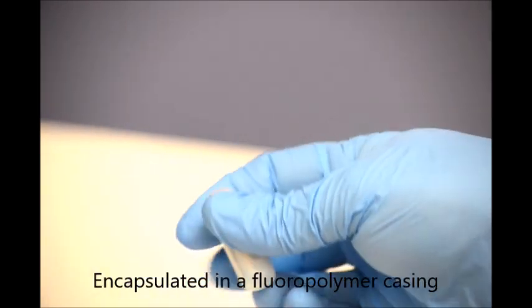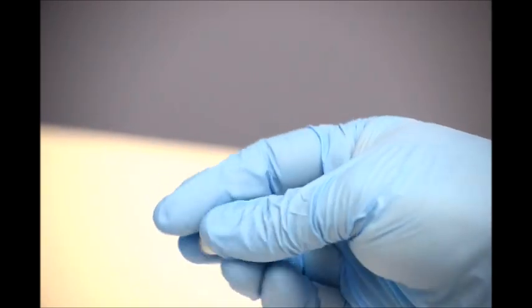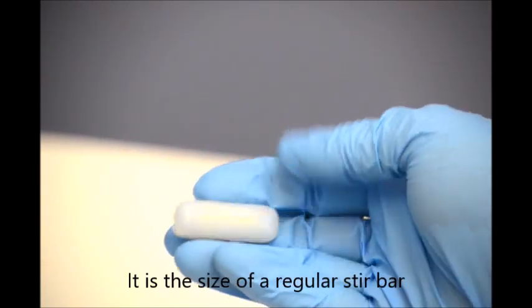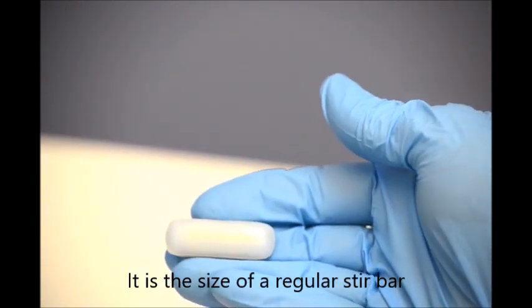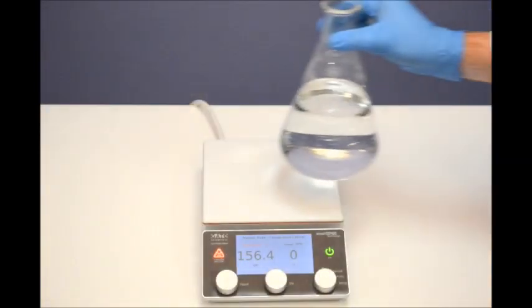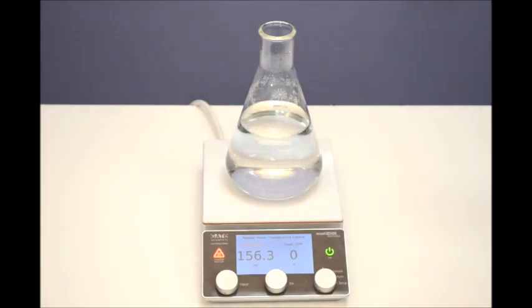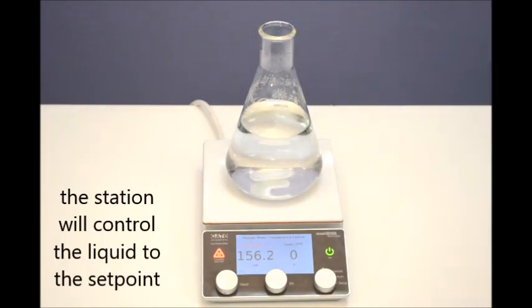The stir bar is encased in fluoropolymer which is inert to most compounds. A container with liquid can be placed on the base station and when the stir bar is immersed into the liquid, it will start transmitting temperature readings of the liquid to the base station.